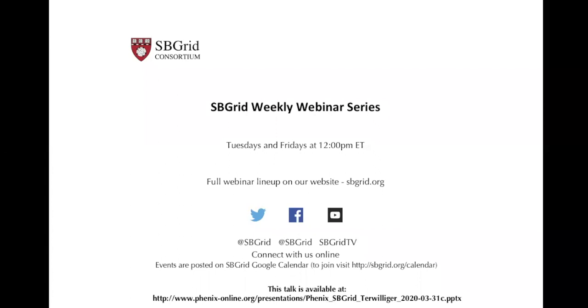If you have the whole map, if you're very lucky, then the Fourier coefficients have errors that are independent between different Fourier coefficients. It's not exactly true. I just want to make sure that everybody realizes that there's a technical thing that makes that not quite so, and that is that your object is very small compared to the box. Therefore, all Fourier coefficients are highly correlated, but only in a special way. So Fourier coefficients that are close have indices that are very similar to each other because the box is big and the molecule is small. Fourier coefficients that have similar indices have very similar values. That's not what I'm talking about.